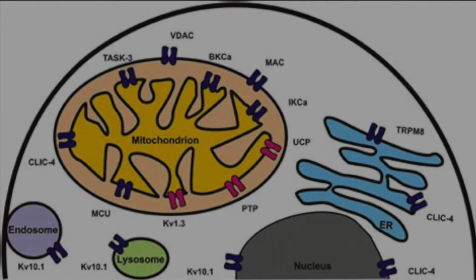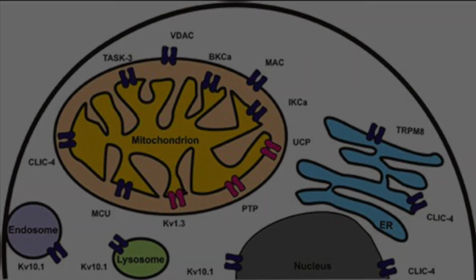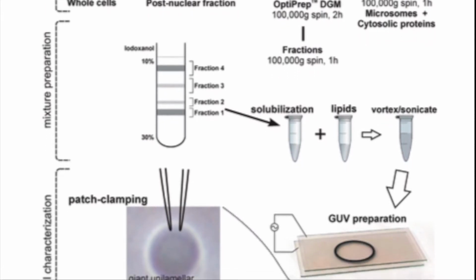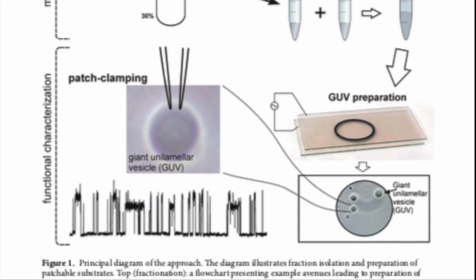Finally, we have to keep in mind that there are also intracellular ion channels. Indeed, 95% of the cell membrane belongs to intracellular organelles, such as vesicles, endoplasmic reticulum, Golgi apparatus, and so forth. But organelles are in the cell, obviously, and too small and inaccessible to be monitored by patch clamp. Nevertheless, today we do have techniques to register intracellular channel activity. The protocol consists in lysing the cells in order to have fractioned membranes, isolating the different types of organelles by centrifugation, and then gathering the different membrane segments in a giant unilamellar vesicle.